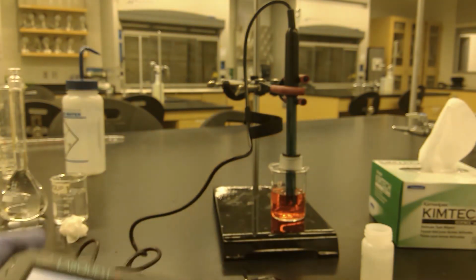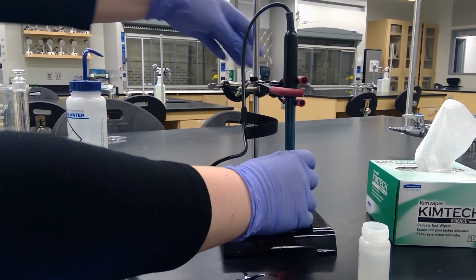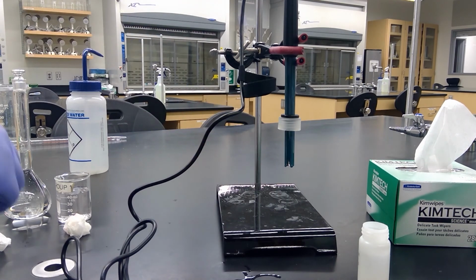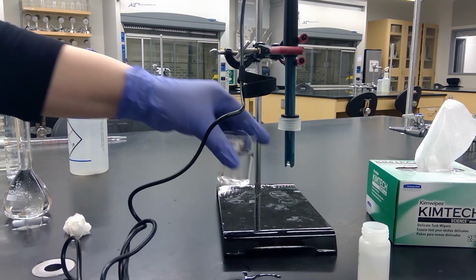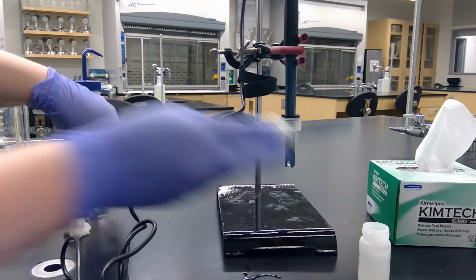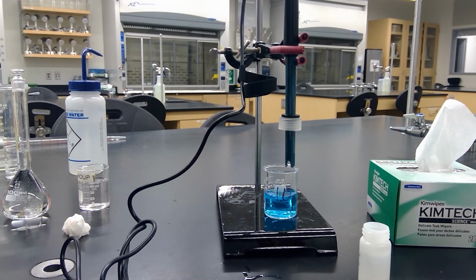And then for the second point, we're going to do the pH 10. So you'll want to blot it, rinse it with deionized water, and gently blot it again. And then we'll put it in the pH 10 standard solution.